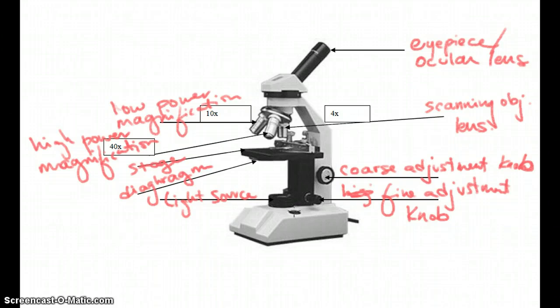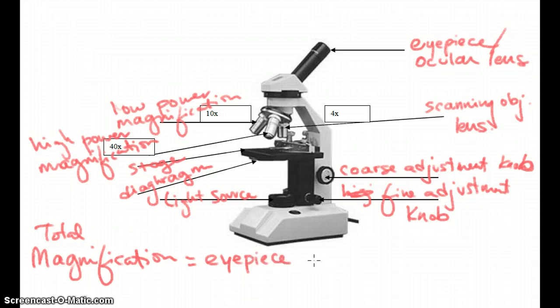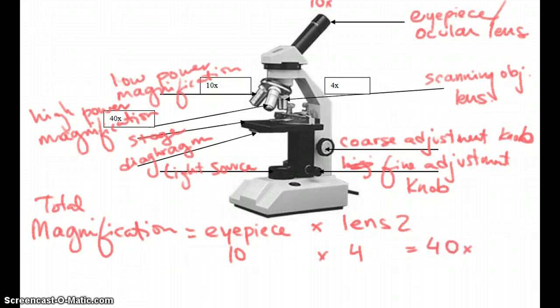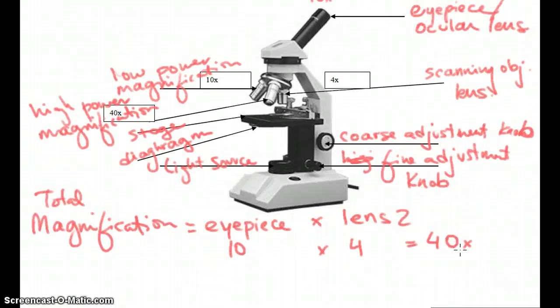Now while that only took four and a half minutes, I'm going to very quickly tell you about magnification. The formula for total magnification is the magnification of your eyepiece or ocular lens times whatever other lens you're looking at. So I'm going to just call it lens 2. So in this case, let's say that your eyepiece is 10x. So it's 10 times, and let's say we're looking at the scanning objective lens. Well, if our scanning objective lens is 4x, then our total magnification is 40 times. So we're looking at something 40 times its actual size.